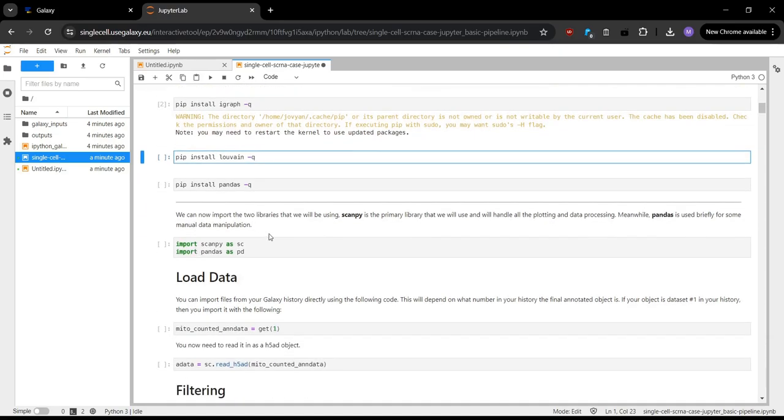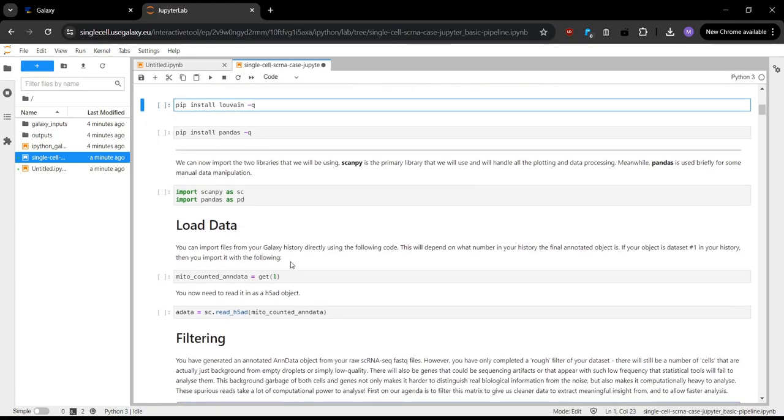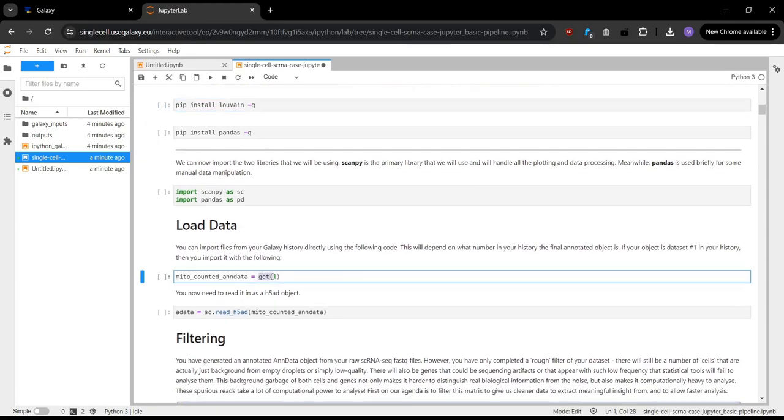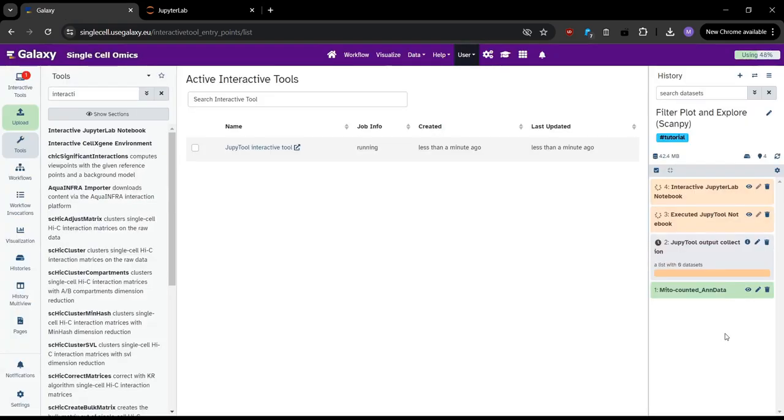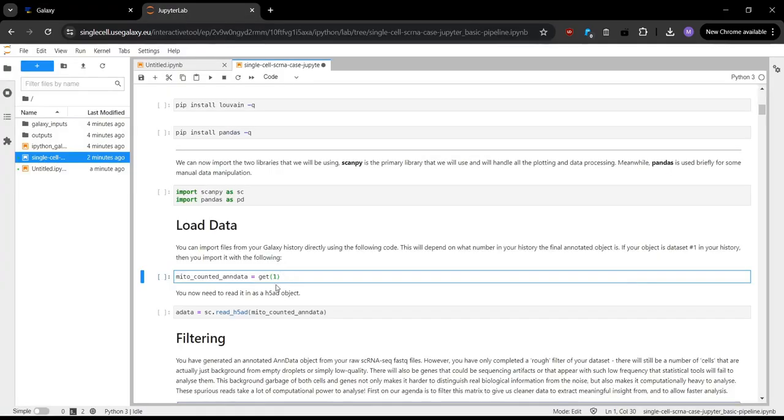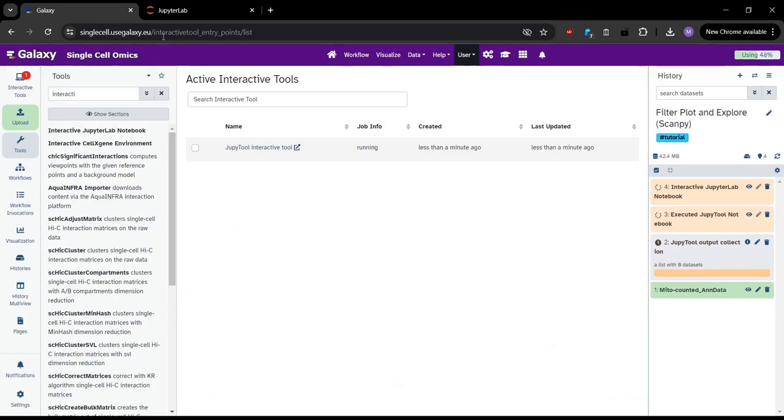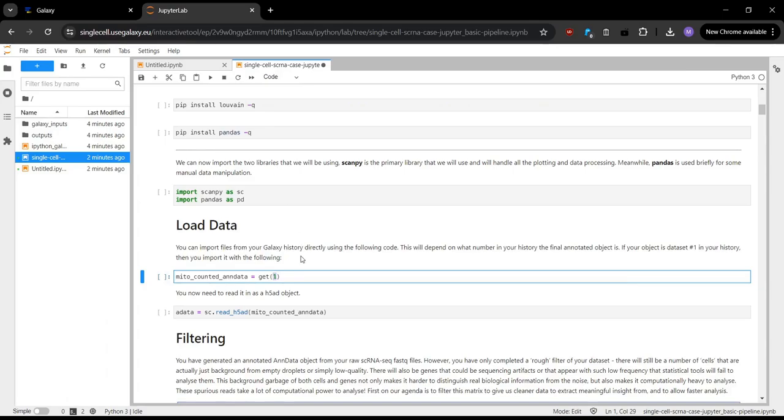And so before running all the cells, one thing to note is that this get function here is specific to Galaxy, and it will fetch in data from our history. So we go back over to our history here, we can see that our anndata file is in location one as marked by this number here. So we want to make sure this number is matching our input. So currently it is, this is one. And in JupyterLab, we can see this is one as well. So that's perfectly fine. But if you're using data in a different part of the history, that number might be different. So you have to make sure to change that number.